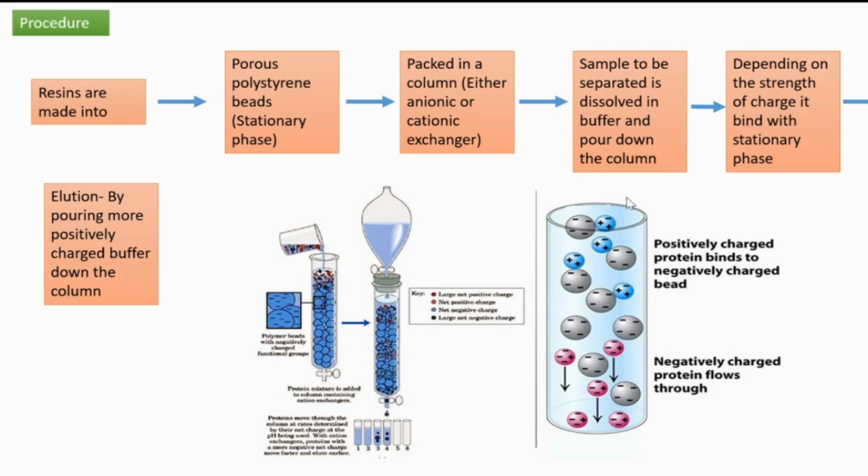As we pour this mixture dissolved in a buffer, those having a high positive charge bind with this ion exchanger, and those that are negative or least positively charged move down. These negatively charged or least positively charged proteins will drain out first.